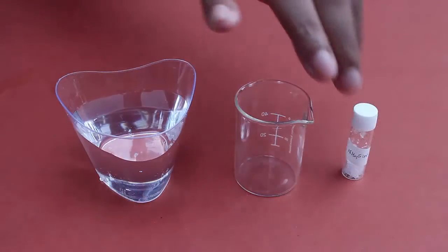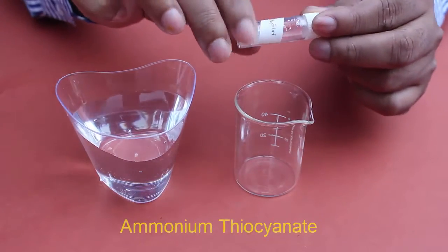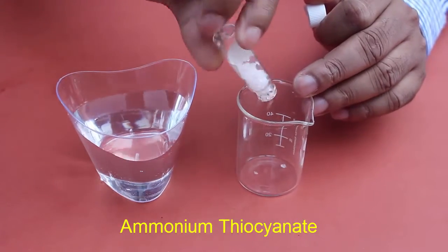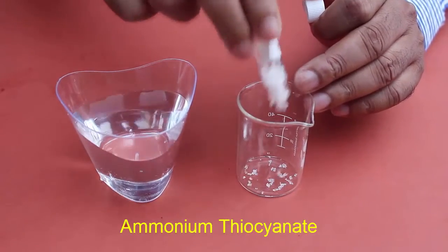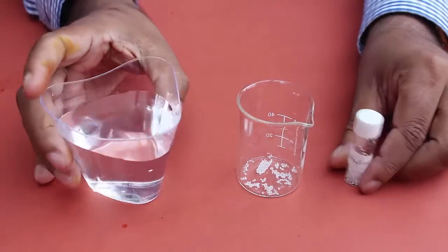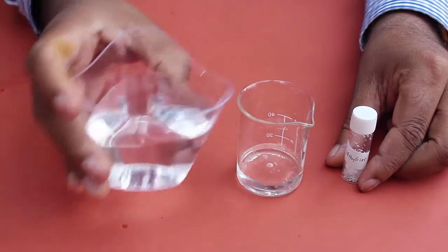Now we are going to prepare a solution of ammonium thiocyanate. These are the crystals of ammonium thiocyanate. We are going to take a few crystals into the empty beaker, then slowly add water to prepare a clean solution of ammonium thiocyanate.